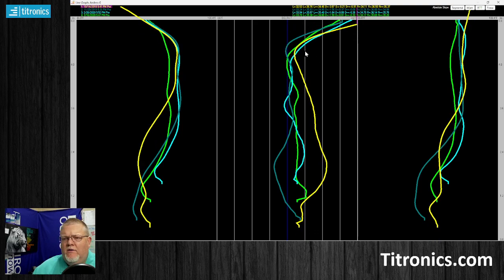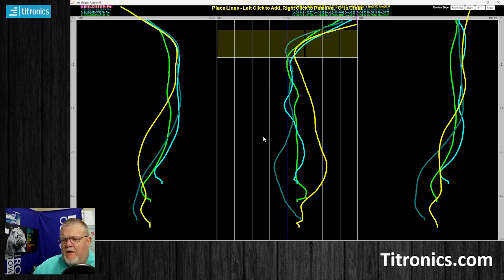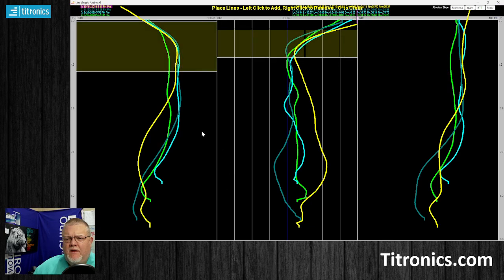And where do I see patterns myself? So I'm going to place a line. I'm going to say, you know, right here is pattern. Another line that I see is, well, that's not really pattern going on there. I don't see much going on there. But I can say over here, this is also pattern. I'm not going to worry about anything down in here. And so I can go ahead and set my lines as well.